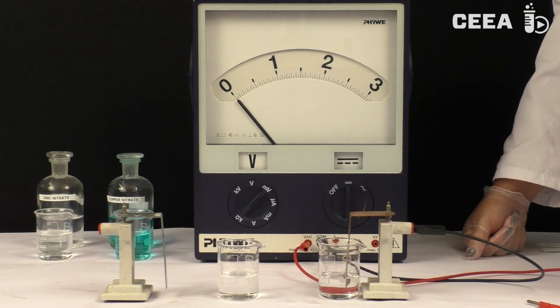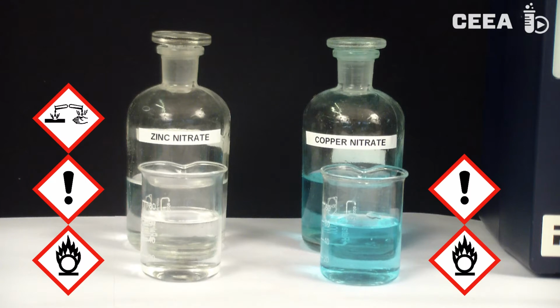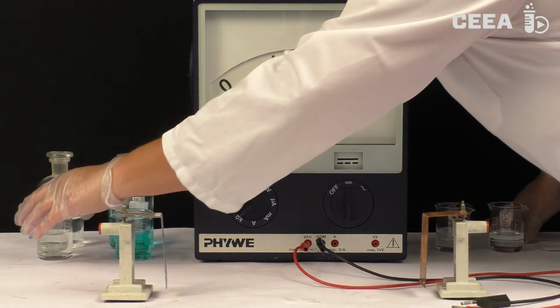In order to answer this question, we have to compare metallic zinc in a zinc solution with metallic copper in a copper 2 solution. We take two beakers, one filled with a 1.0 molar zinc nitrate solution and the other with a 1.0 molar copper 2 nitrate solution.